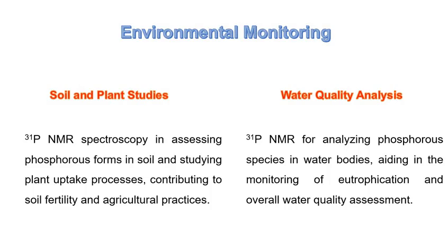So P31 NMR spectroscopy in assessing phosphorus forms in soil and studying plant uptake processes, contributing to soil fertility and agricultural practices. P31 NMR for analyzing phosphorus species in water bodies, aiding in the monitoring of eutrophication and overall water quality assessment.